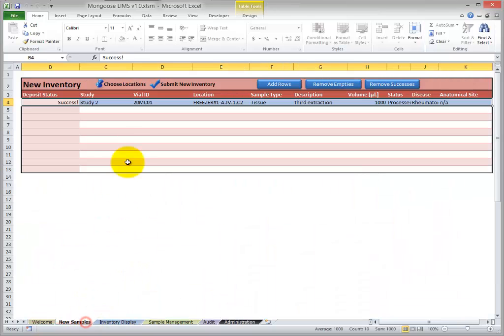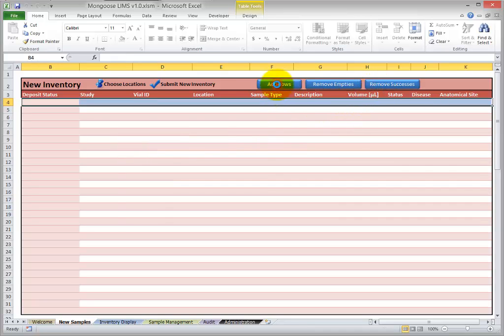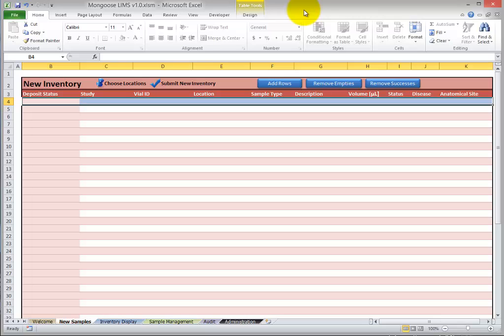So I'd like to add a lot of samples now for two reasons. First, so you can see the accommodation for duplicate vial IDs and children. And also so you can see how easy it is to add large quantities of inventory to Mongoose LIMS. So I'll speed the video up while I copy and paste the information in.